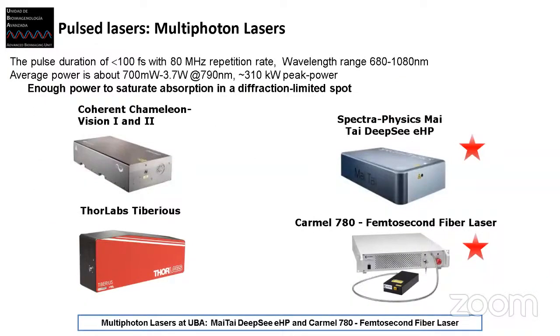But what else is out there? Well, we will do a practical session with the pulsed laser and multiphoton microscope. And basically, these lasers are very powerful, and there are many on the market. These are 4 brands that I want to highlight.